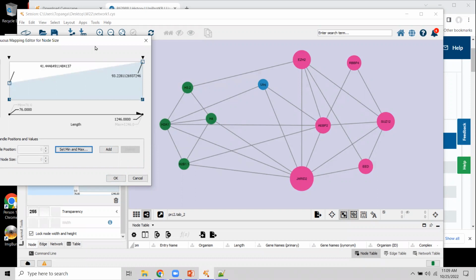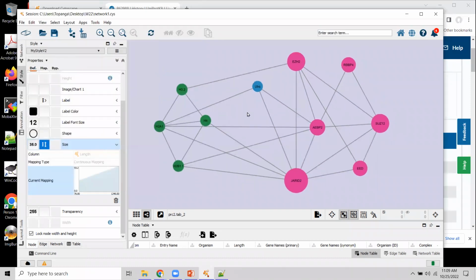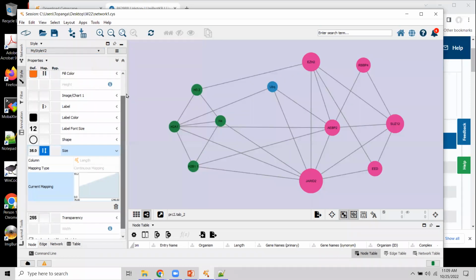more or less okay. So here's the rendering of the interaction network that somehow conveys how large those individual proteins are. You see the ubiquitin is tiny, histones are tiny, the members of the polycomb complex are way larger. So here's another way of drawing the network, and we can take this thing once more.